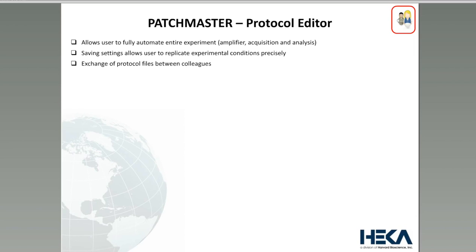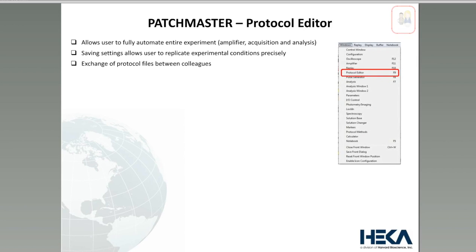And this is basically the third point: you can write a protocol and exchange it between colleagues, or if you have undergraduates or graduate students or beginners that just started to learn how to patch and how to do experiments, that is very helpful for them to not have to deal with all the fine-tuning of an experiment. You can give them the protocol file and they can do the experiment exactly like it's supposed to be done. The protocol editor is opened up by pressing F9.